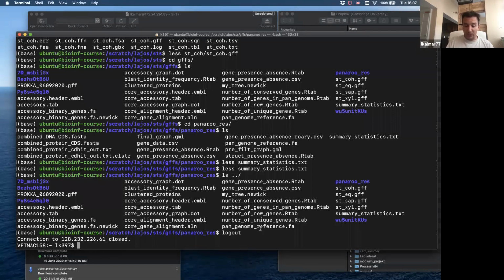So I will give you on Thursday this document, this help, but we will actually continue with the real creation of trees, how we can build up trees, what kind of different methods we can use to cluster our samples, how we can visualize the tree, and also I think it's good if we go into a bit of visualization using iTOL and visualize phenotypes as well, not just the genotype differences.